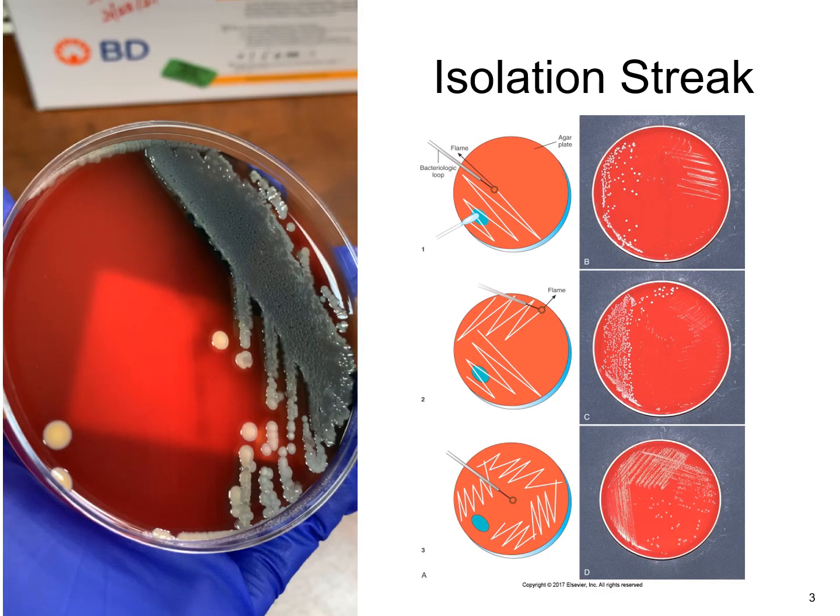So when setting up a culture, you are streaking the plate to try to get isolation. You are typically using a 4-quadrant method where you start in the first quadrant, you streak it, and then you turn the plate. You go back into that first quadrant a couple of times and streak it out.